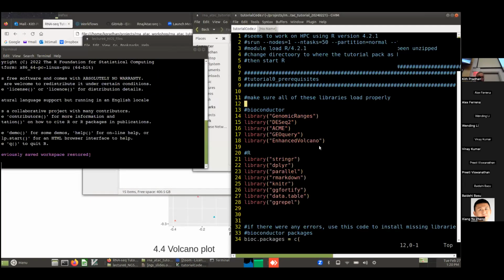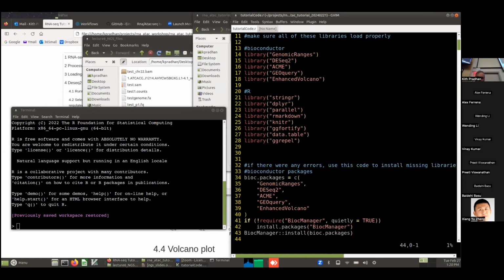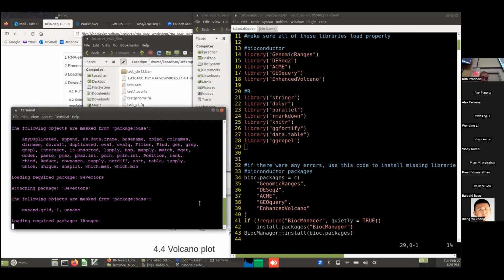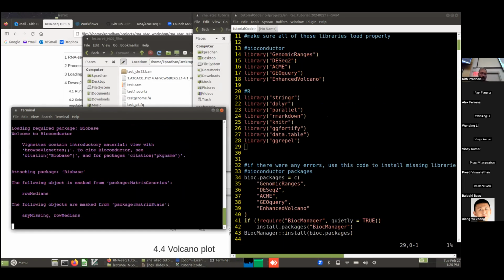I guess just to add to the question, if you're really wondering what parameter to use, a lot of times R has built-in manuals.